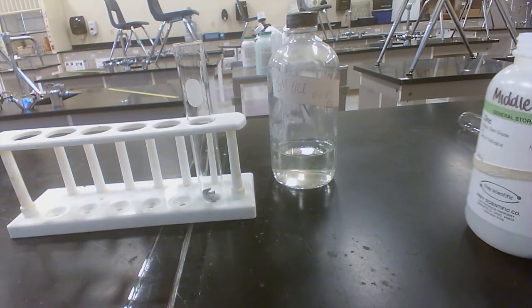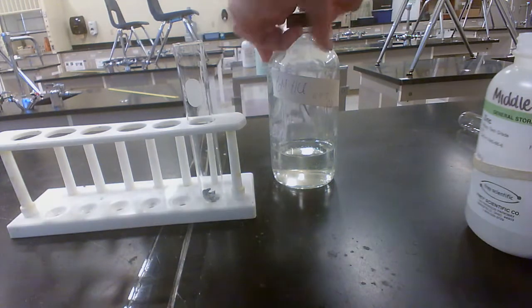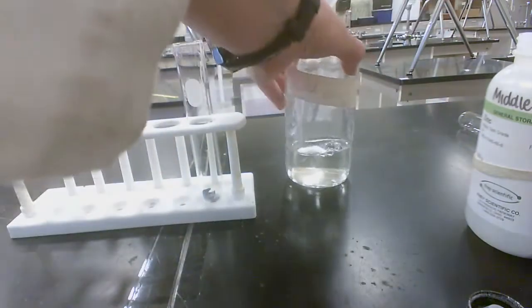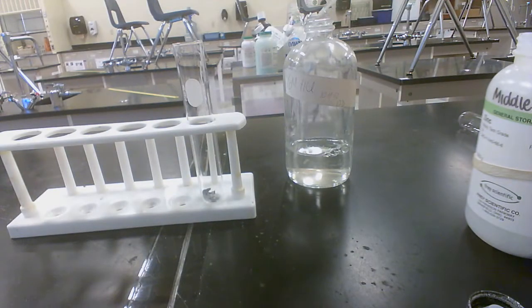Now I'm going to add a squirt of six molar HCl. That means there are six moles of hydrogen chloride dissolved in every liter of water. Okay, so now I'm going to squirt.